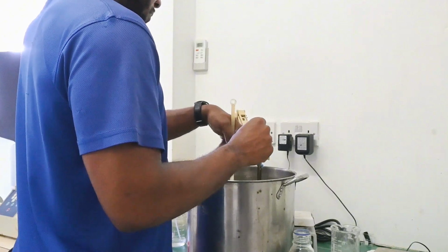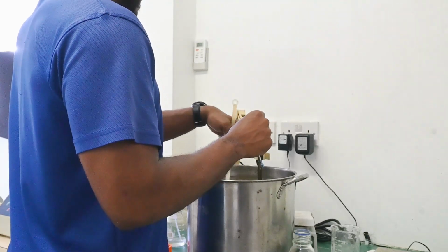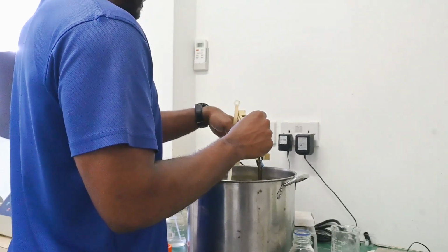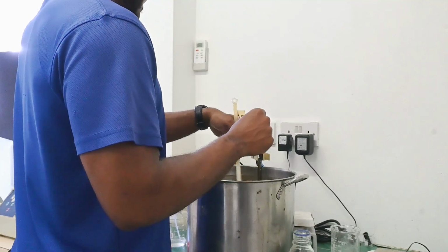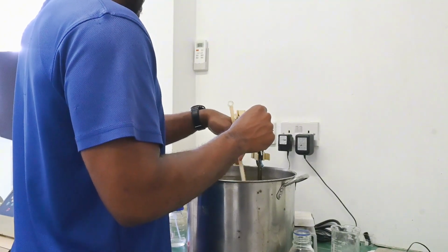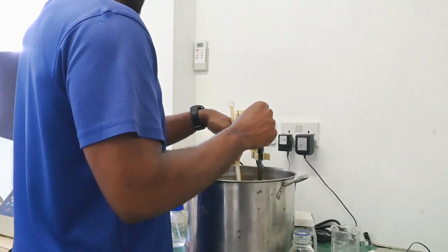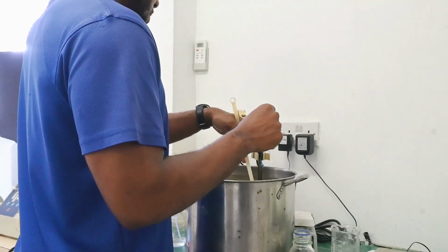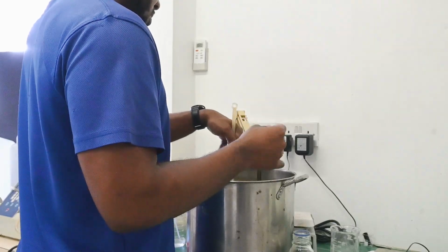So I'm adding enough to get it down below the 6, so it will make it easier for me to get the reading at 5.7. So the reading has gone down to 5.72.